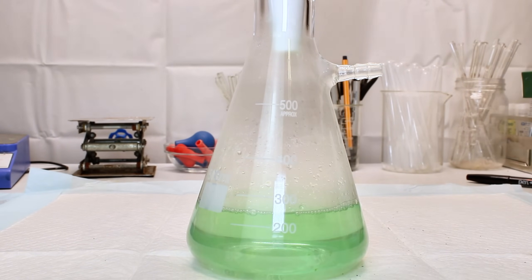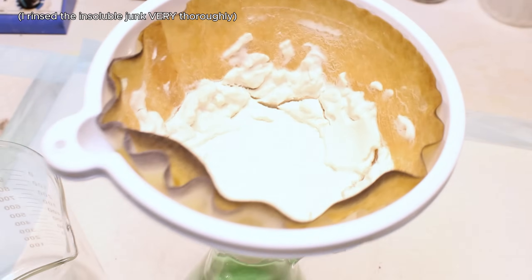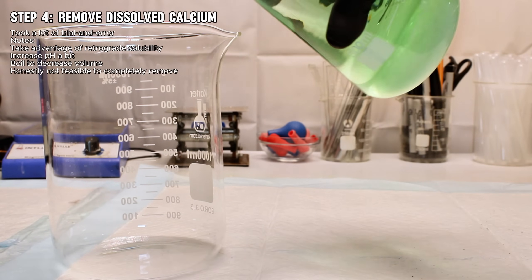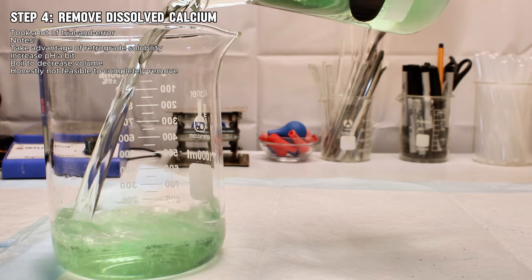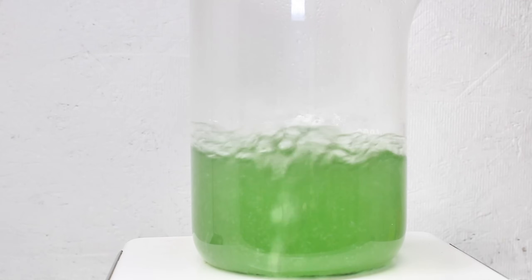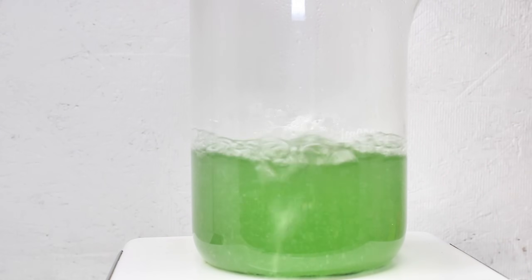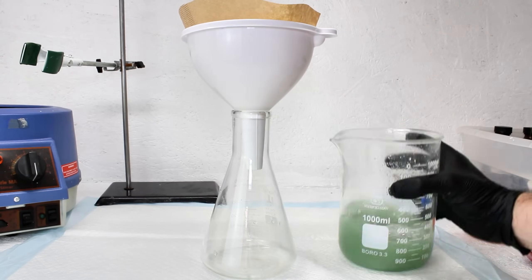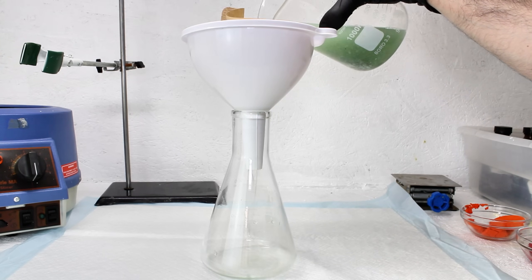The resulting filtrate was a cool green color, which is typical of iron sulfate, but there was still a good deal of dissolved calcium here. To remove as much as I could, I brought the pH back up to 3 with a bit of sodium hydroxide and boiled off some of the excess water. This precipitated some calcium salt, though I'm not really sure if it was sulfate or more phosphate. Regardless, I got rid of it by another filtration, leaving me with a nice, clear, and mostly pure solution of ferrous sulfate.